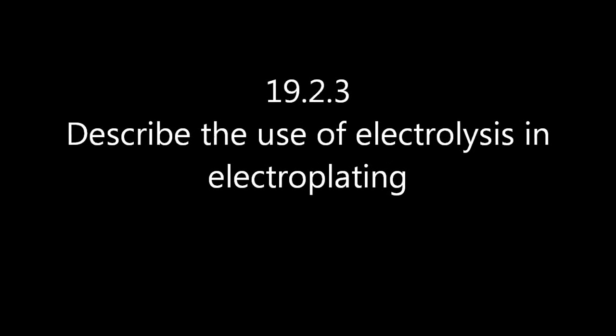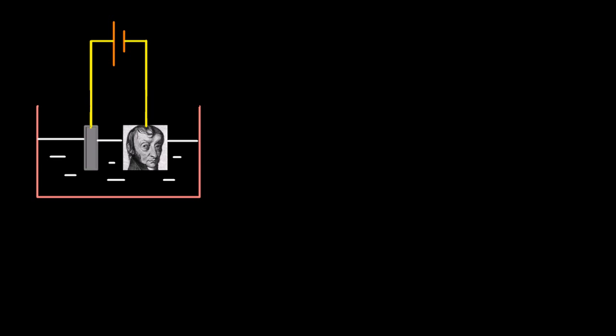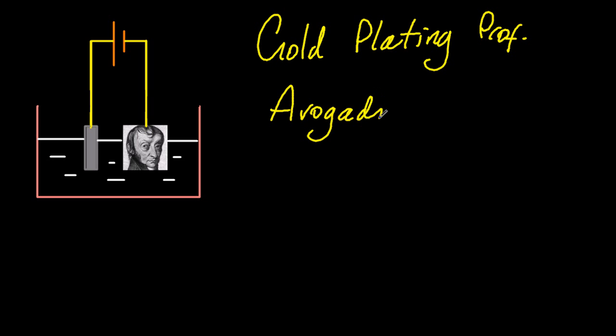Describe the use of electrolysis in electroplating. Well, here's my electrolysis setup. Normally, you'd have something metallic to be electroplated, but I'm going to electroplate Professor Avogadro today.